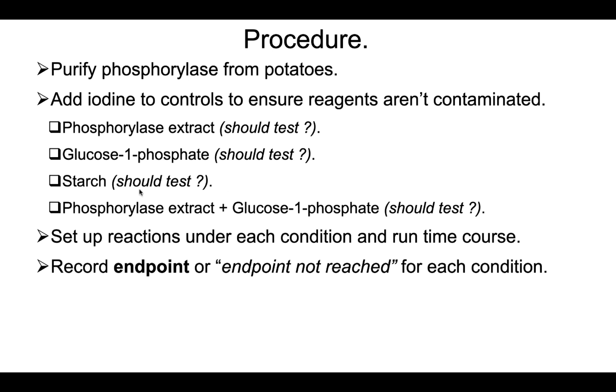Once you've figured all this out, then we're going to set up the reactions under specific conditions, different pHs and different temperatures. You'll record the endpoint, or you'll record that the endpoint wasn't reached if you didn't get an endpoint in 20 minutes for each condition. And then from there, you will write up your lab assignment.